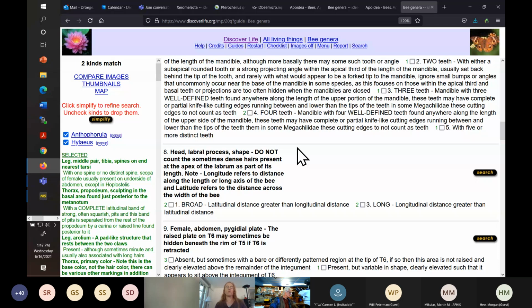PD asked, earlier during the class, what are the precautions you must take while spreading the bee specimen so that we can see as many morphological characters as possible? So the main precaution is to do it when they're fresh. Fresh meaning just caught out of the kill jar or the bowl or whatever, then is the time to spread the mandibles and pull the tongue.